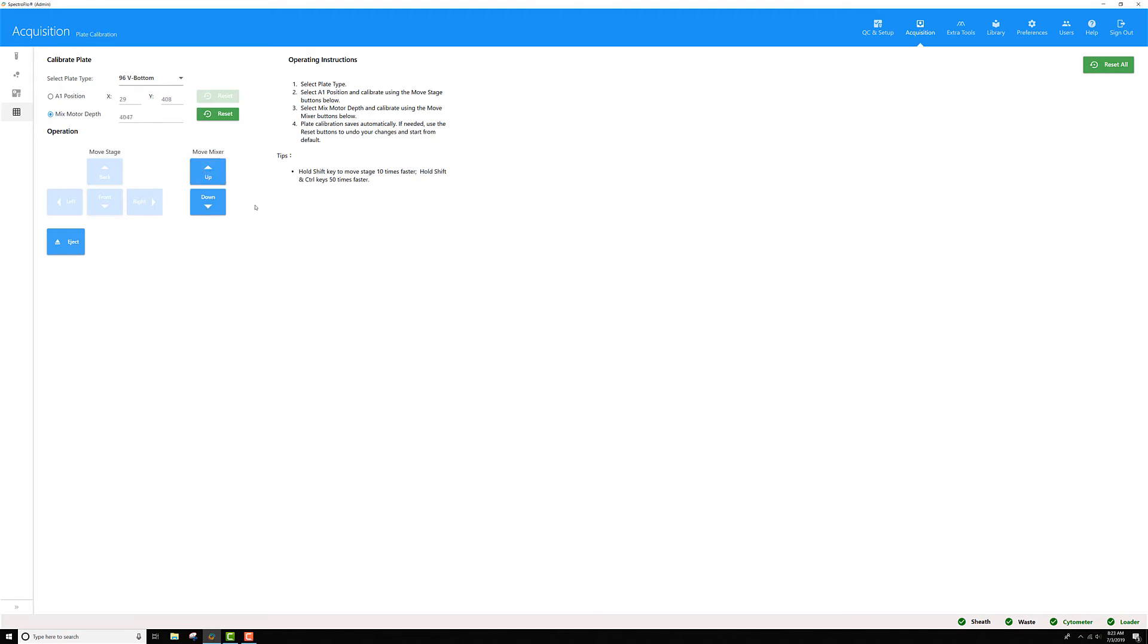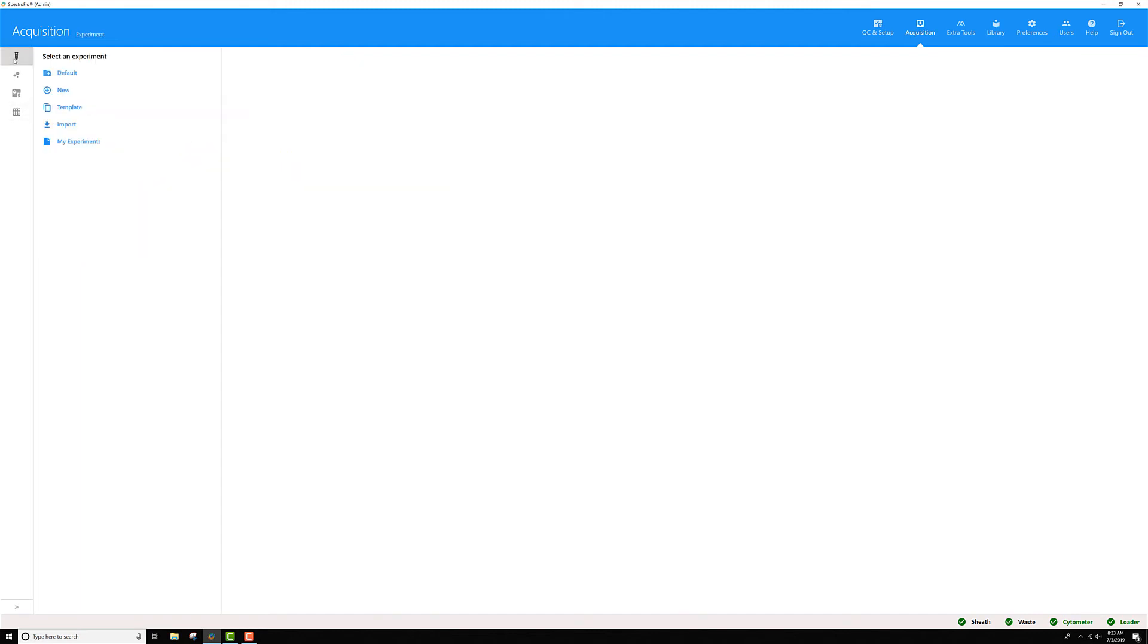Once you're happy with your settings, it saves automatically. You simply toggle away, back to your experiment.